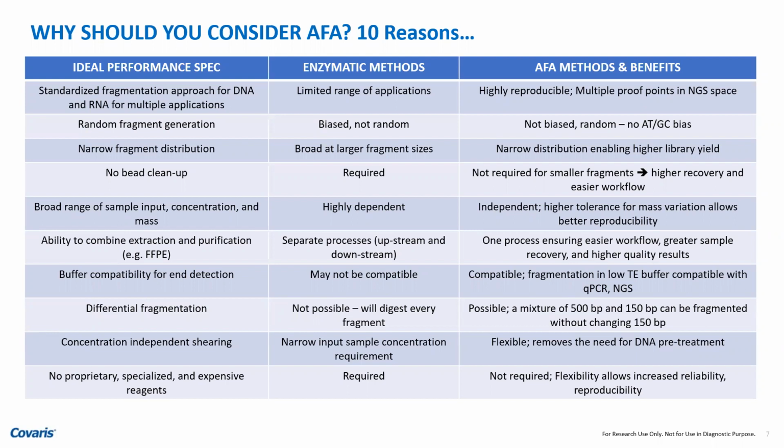So when you shear the DNA, it is an unbiased shearing, which is why you will also have a much tighter grouping. So if your target is, let's say, 175 base pairs or 250 base pairs or whatever, you will have a much tighter grouping. You will not have a variability like, for a 175 base pair target, 125 to 250. You will probably see it between 165 to 180. That's the range with tighter grouping, which means you have better yield of your target DNA. Hence, you will have better data or better confidence in the data downstream.